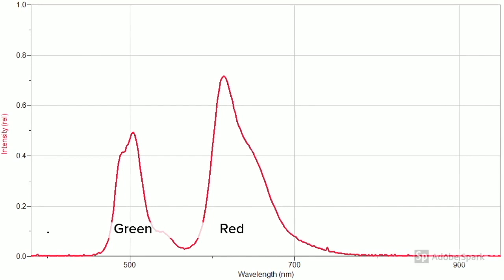This information tells us that we have separate emission peaks for each color. Even though the color visibly changed when the red and green dyes were mixed, the composition of the red and green dyes did not. So the lambda max should and did remain the same.